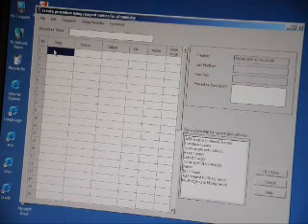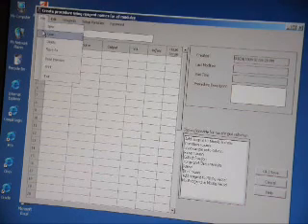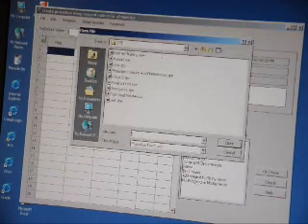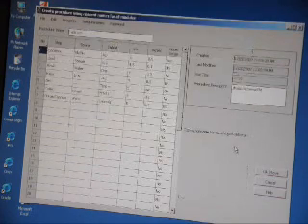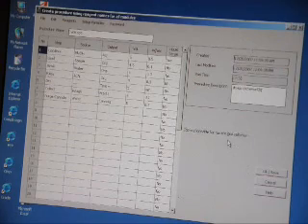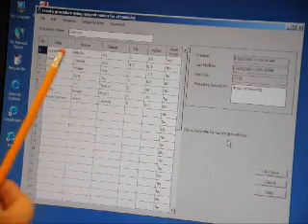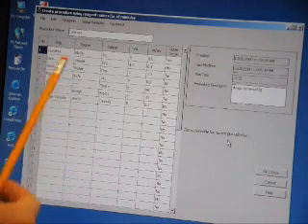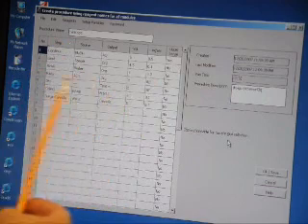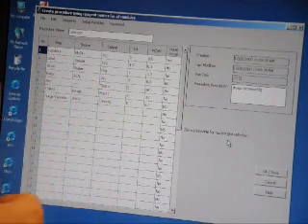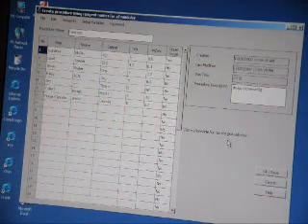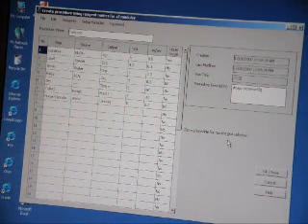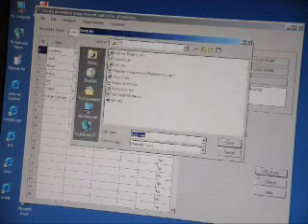Now I'm going to open up the method here. I'm going to say file open. And this method is just named Lynn. And this method just has a couple quick steps of condition, load, rinse, dry the column with gas, collect, and then purge and clean the cannula. I'm going to save this method.